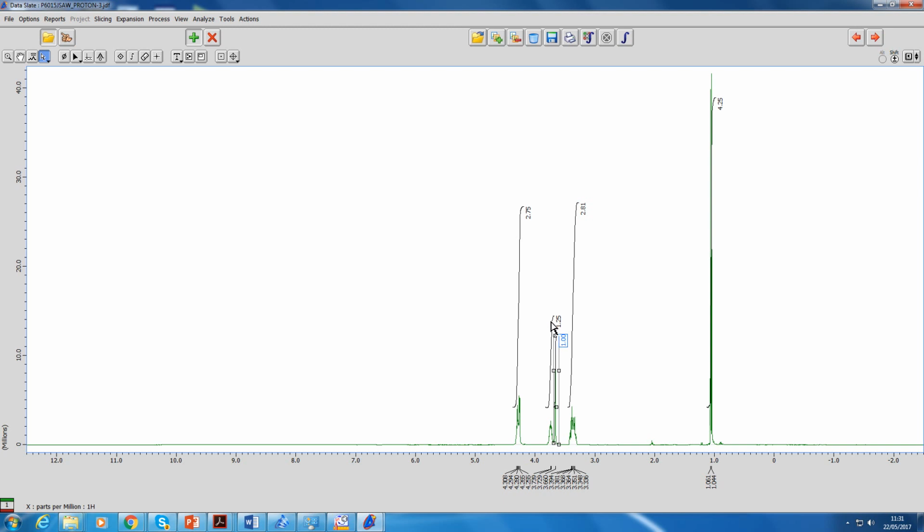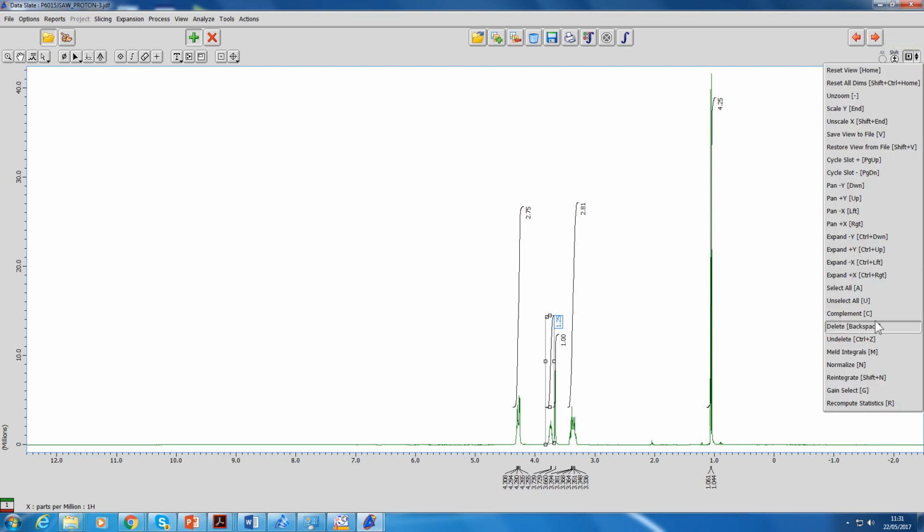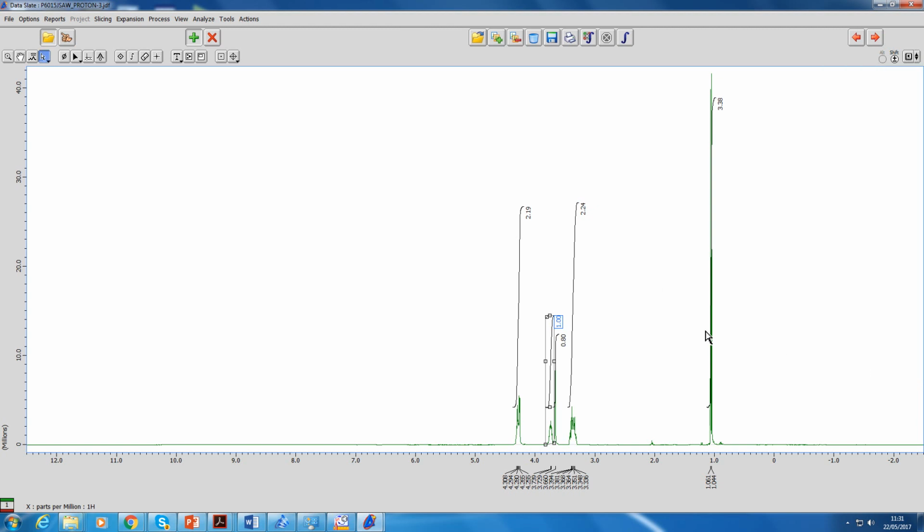Now we got 1, 1.25, 2.75, a bit higher than 2, and that's certainly higher than 3. Let's see what happens if I base it on the 1.25. Click on that one and then click on the K down to normalize, and that's a bit closer to 1, 2, 3, something like that.